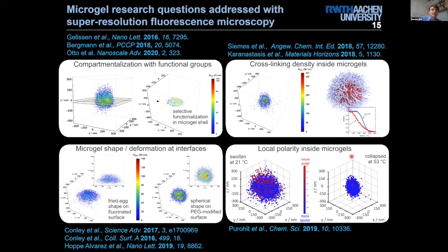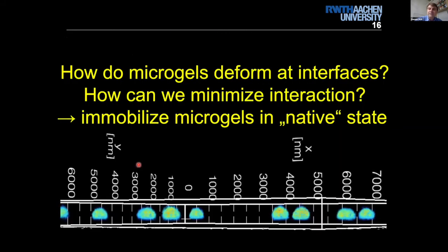Coming to this microgel shape and deformation at interfaces. We wanted to do super resolution with these microgels, and to do super resolution, you have to have them immobile for some time.